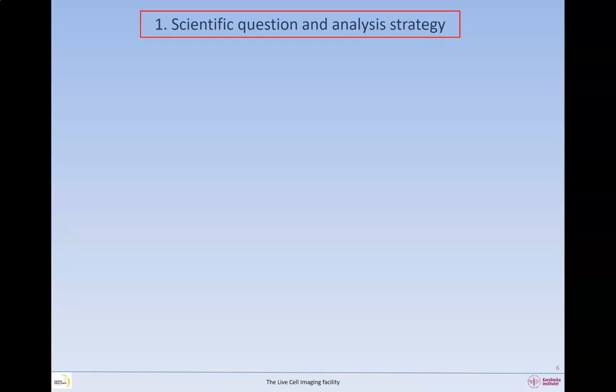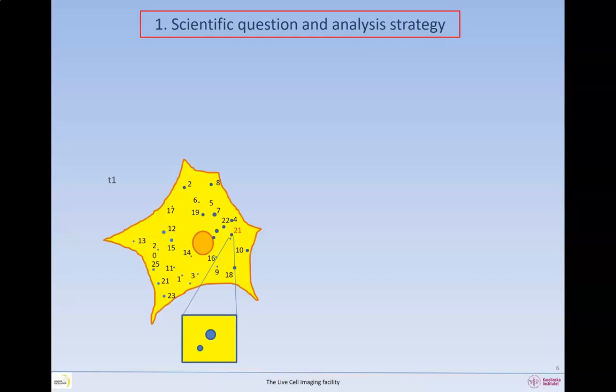Let's say that you want to count the number of vesicles in your cells in an overnight live cell imaging experiment. At the beginning of your experiment, the dots seem not to be very crowded, and you can distinguish them individually and even count them. Thus, your imaging requirements will suffice using a low NA objective, resulting in low resolution and contrast in the image.